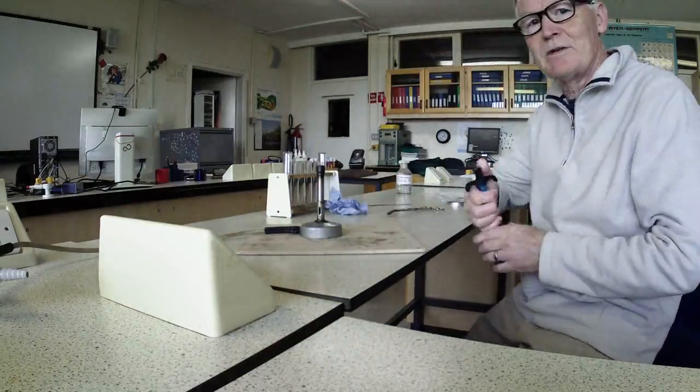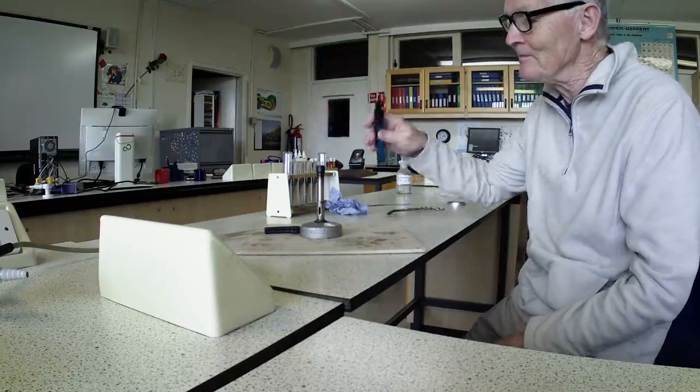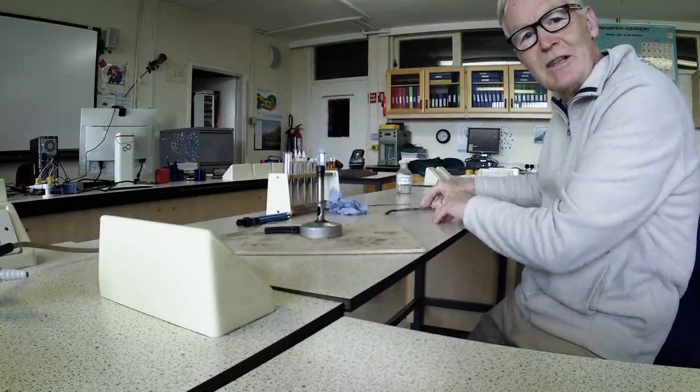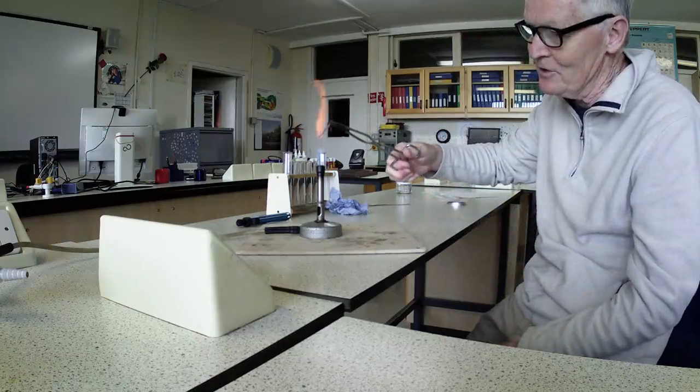For this experiment, I'm going to use my old friend George. Can't use Susan, I've given Susan away. So here's George. You've seen this many a time. It's taking a piece of magnesium ribbon and just simply reacting it. So the magnesium ribbon.